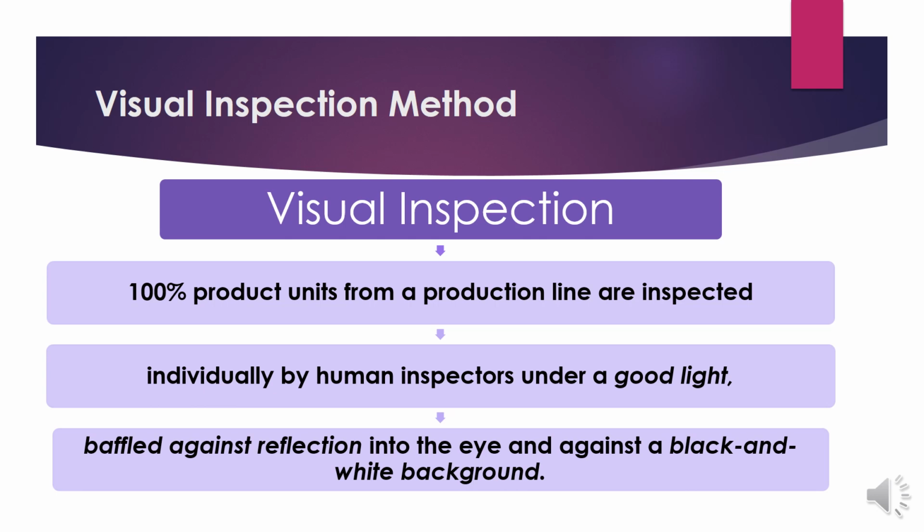That is how the product is checked against a black and a white background. Each component is checked under good light against a black and a white background.